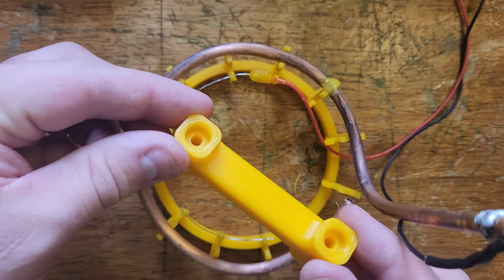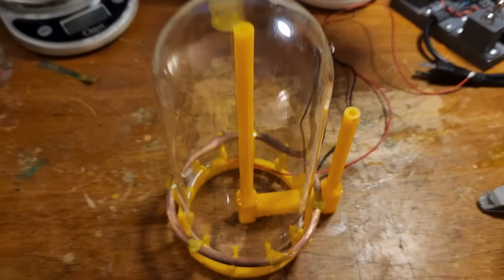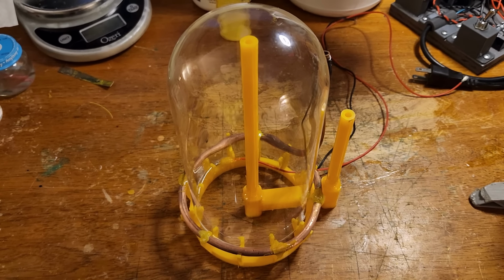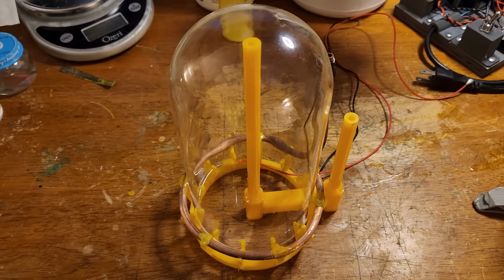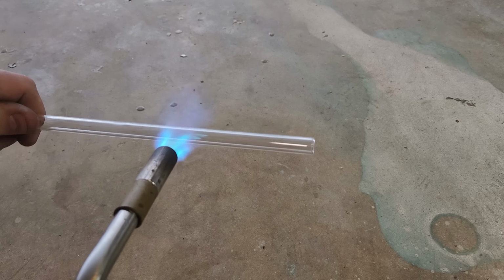Then I constructed a suction tube for the anode gases with some more ABS parts. Here's how it looks with the glass bell over it. But unfortunately, the ABS tube was porous and leaked, so I had to use glass instead. This was a pretty good opportunity to try some glass forming, which I'd never done before.